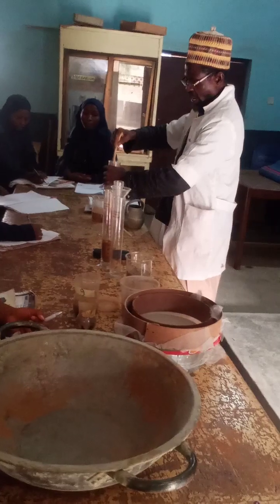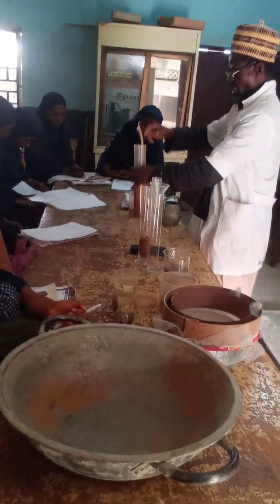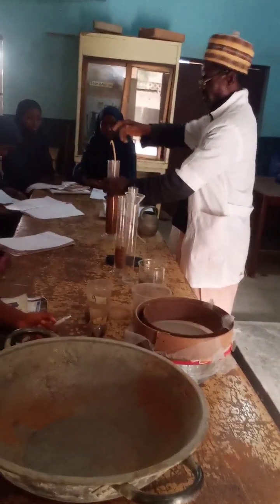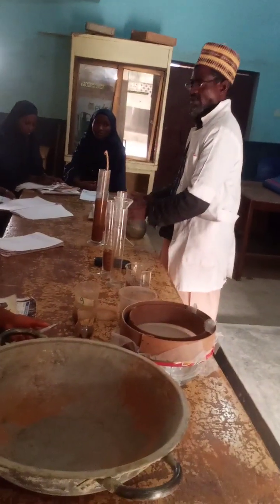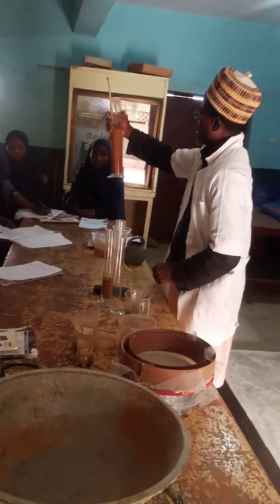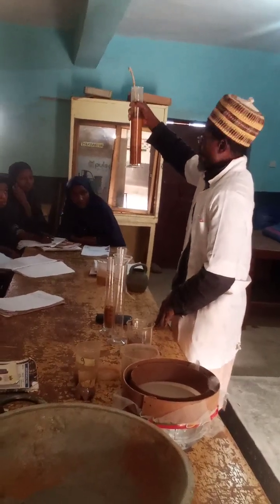Then you stir it thoroughly. After stirring it thoroughly, you leave it to settle down for a few minutes. Is that clear? So these are the procedures you are going to follow. After you have left it to settle down, the next thing is to look at the way the particles are settled down according to the size of the particles.